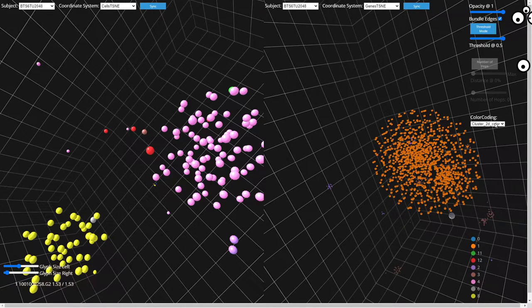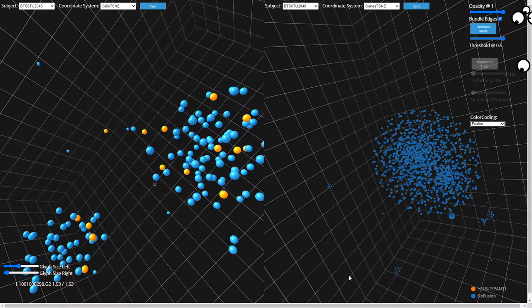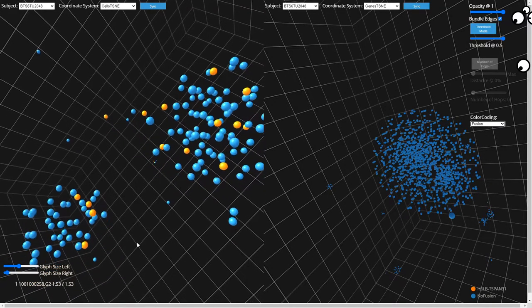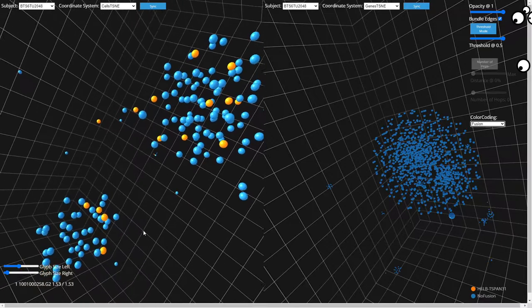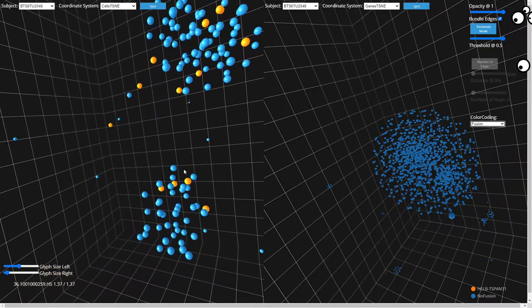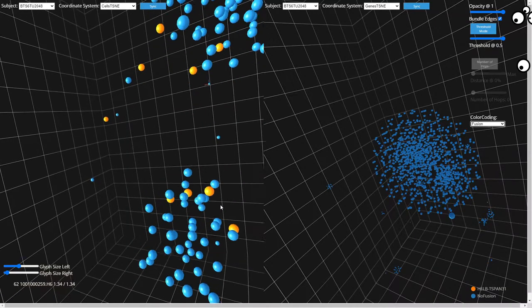And so to perform a gene-of-interest-based coloring, I have this helicase B tetraspanin 31 gene that I'm interested in in this data set. So I've created a coloring that highlights cells harboring this fusion of helicase B and tetraspanin 31, which was formed when maybe a cancer cell had some chromosome damage that was repaired in those two chromosomes, and they spliced those genes together.